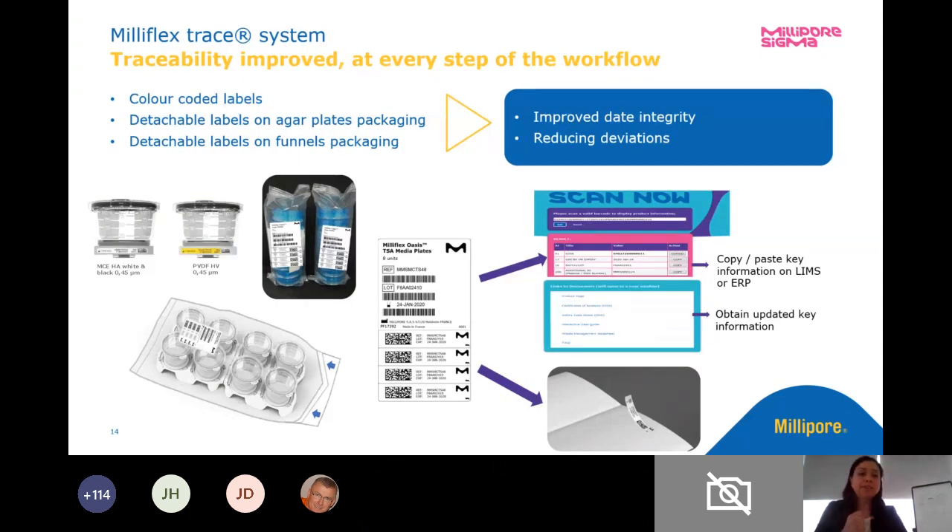Finally, traceability. Traceability is definitely something that has been highly incorporated and everybody has a need for. We've really looked at how people are determining their needs for traceability in the lab and made that as easy as possible. We have color coded labels — the labels on our packaging can actually come off so that we can affix those labels to a notebook or one of our worksheets. If we're using paper, we can scan everything with our LIMS system, as everything is barcoded and can go right into our LIMS systems. All of our information is on every component — our filter units, our media cassettes, and the outer packaging as well. Barcodes everywhere.